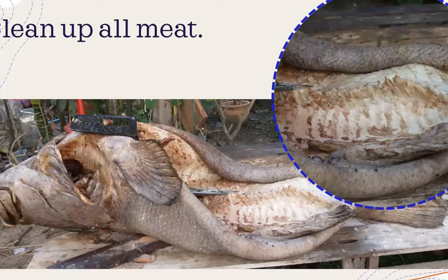Because when we start taxidermy, if the conditions are not good, do not do taxidermy on a large fish in the rainy season, because all of my specimens were lost from fermentation. Many of my big fish, my good fish, are gone. Then I put them in the freezer first. When the dry season or hot weather comes, okay, we start to do the last specimens.